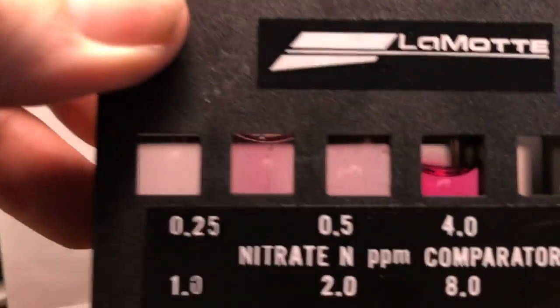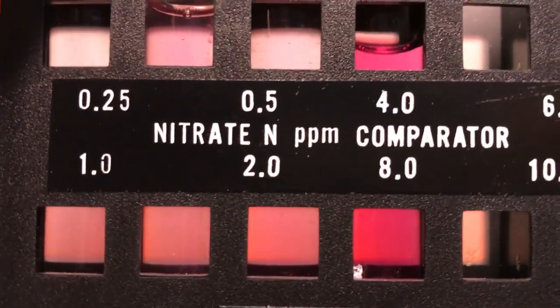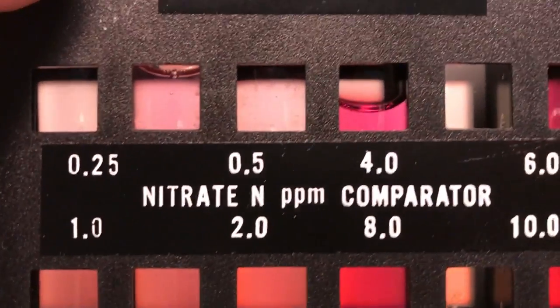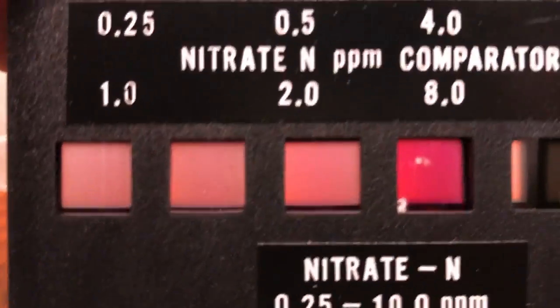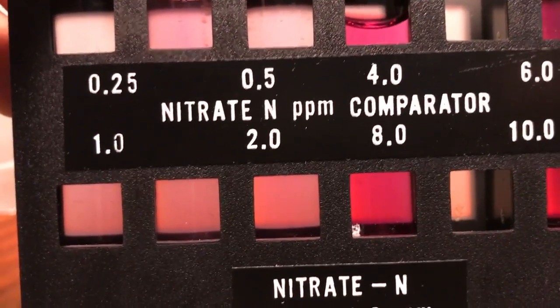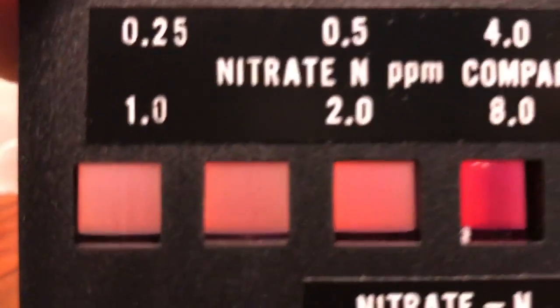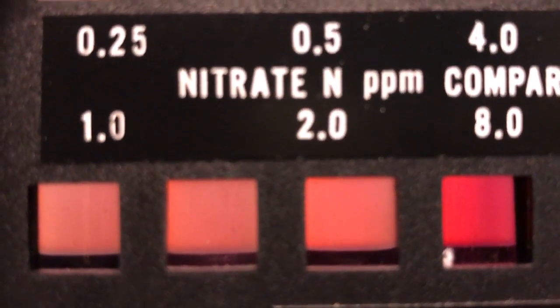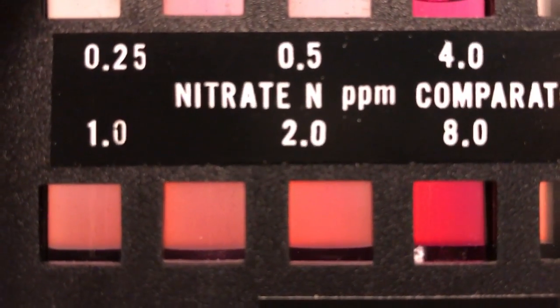I'm trying to give you a better picture here — here's a little better shot against a dark background. It almost looks like one to two parts per million, but the two is a little darker. The camera's not picking up the actual darkness — it's not quite one, but not quite two. Two is a little darker. We're getting into gnat hairs here. When people use an API test kit it gives you a guesstimate — that's all it's giving you, not a true accurate nitrate reading, just a ballpark figure.